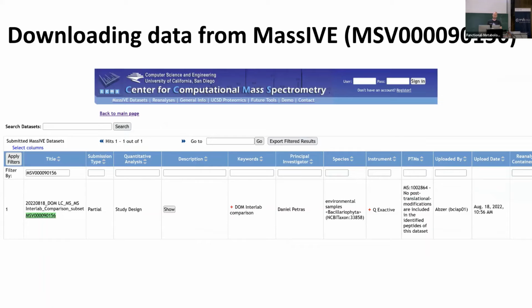But then if you click on browse public data sets, you can basically see a list of all public data that's in there. It's interesting to see what other people made public. You may see a couple of things come out after they publish, but often you also see, oh, there's just this data set and no publication out yet.